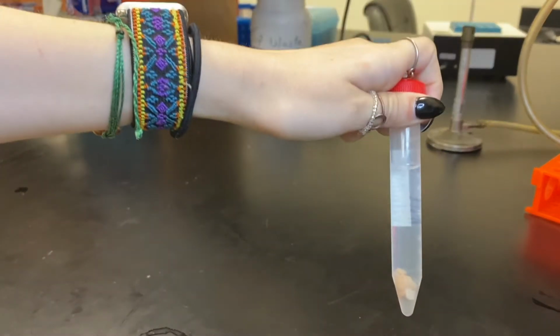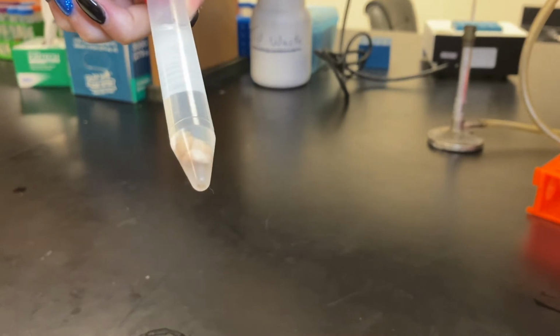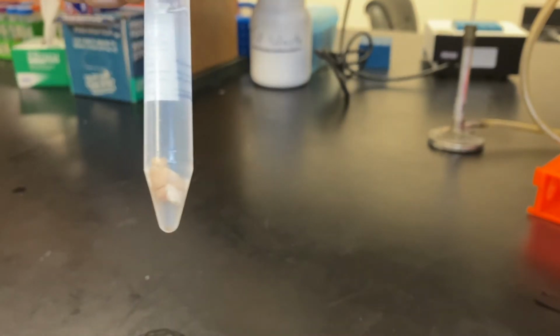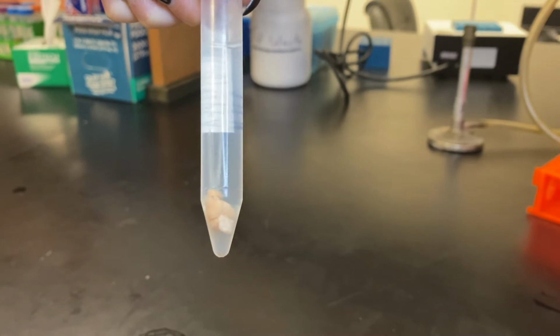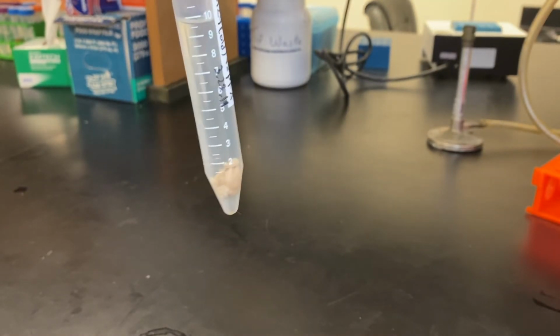Here's the mouse brain I'll be using for today's procedure. It is perfused with 4% PFA and left in the fridge overnight. It's important not to leave the brain in PFA for longer than 24 hours because that could result in damage to the cell membrane, making it unfit for DiI staining.